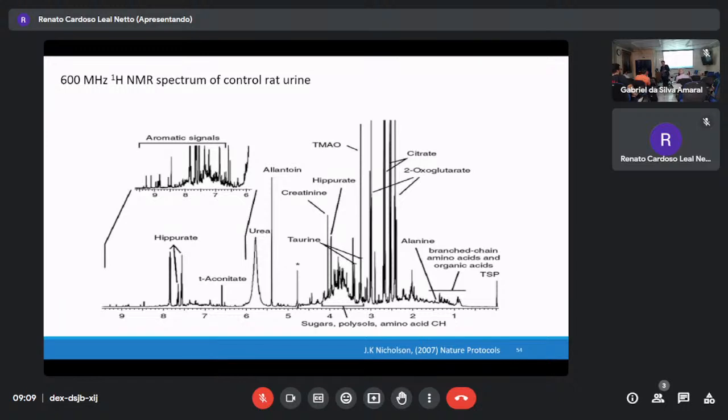Yeah, it's very easy. The second point is, when you handle a biofluid, the most interfering chemical group is protein. But urine, ideally, should not have protein. If you have protein, you have a hidden malfunction, right? That's why urine is the easiest, and metabolomics and clinical studies started from urine. Also, the volume doesn't matter. You collected 1 liter, 2 liters, anyway, your organism is still alive for human beings.